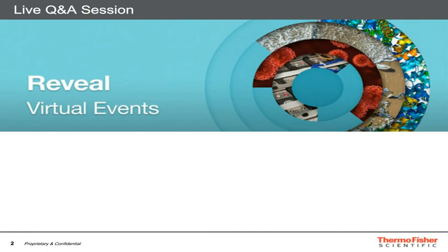Great. The next question is about XRD analysis. Is there a single XRD instrument that can do all the different types of XRD analysis and extract all the relevant information from it? Yes, in a way, how can you make an instrument that performs every type of XRD measurement? That actually does not exist, because there are really different types of techniques. But there are instruments from Thermo Fisher, and you have a broad range of instruments available that can cover a very broad range of applications.